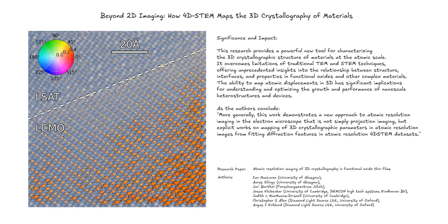This deep dive has explored the complexities of atomic resolution imaging and crystallography. We've uncovered the power of 4D-STEM, the importance of strain engineering, and the intricate relationships between crystal structure and material properties. We encourage you to continue exploring the world of material science. There's a universe of knowledge waiting to be discovered. And perhaps one day, you'll be the one making groundbreaking discoveries using these techniques.